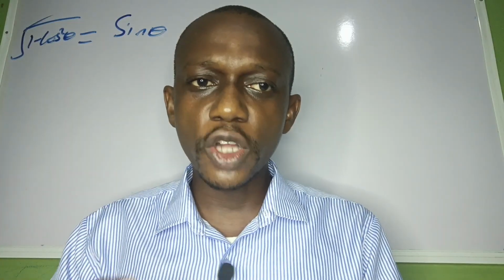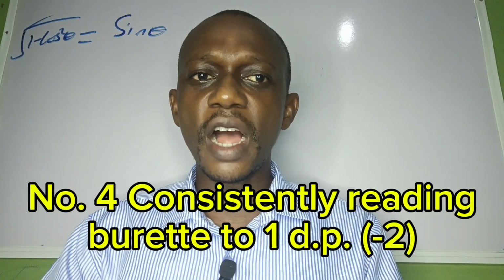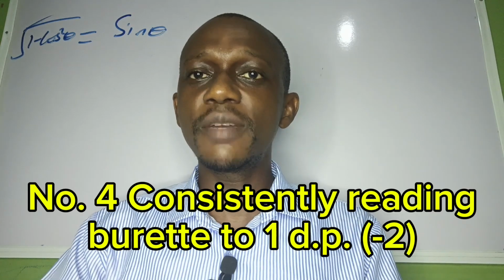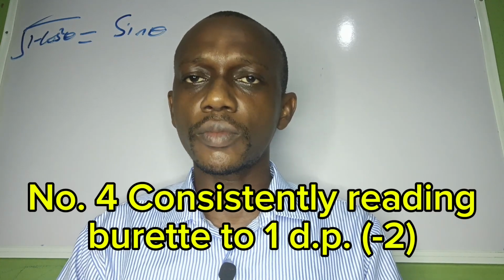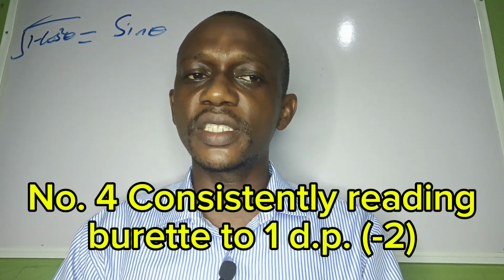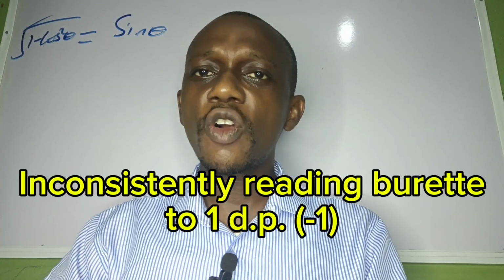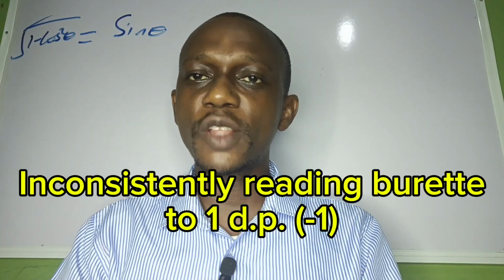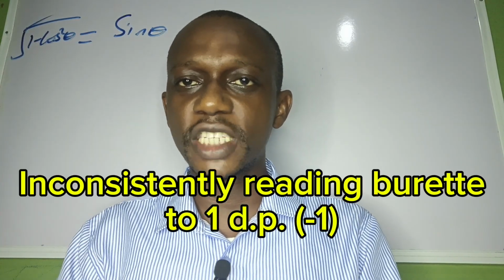Okay? So the 4th one is if you are consistently reading your burette to 1 decimal place. Your burette reading must be 2 decimal places. -2 will be deducted for that. We call it CBR. Okay? Now, inconsistently reading your burette to 1 decimal place. Maybe for part of your titre values, you put it in 2 decimal places. Another titre value, you put it in 1 decimal place. If you are inconsistently reading it in that manner, -1.